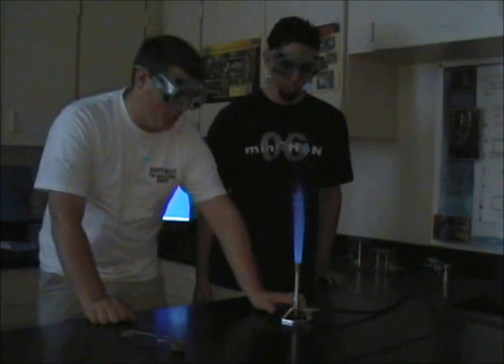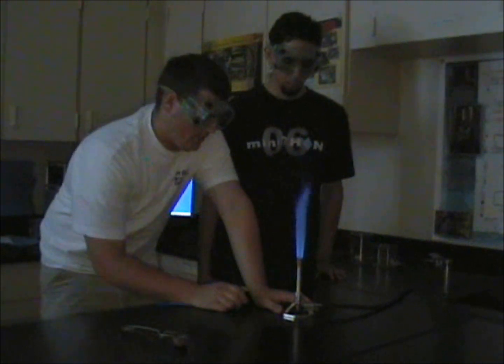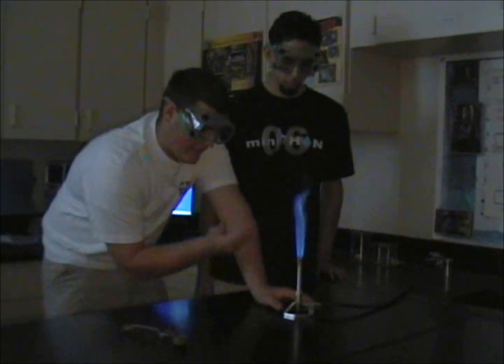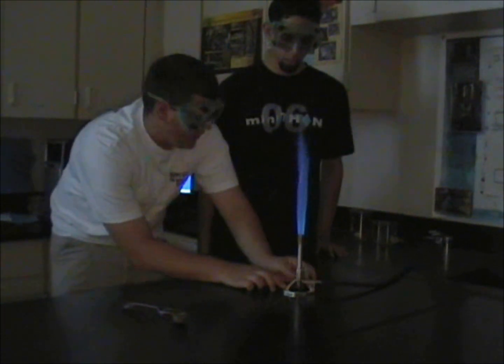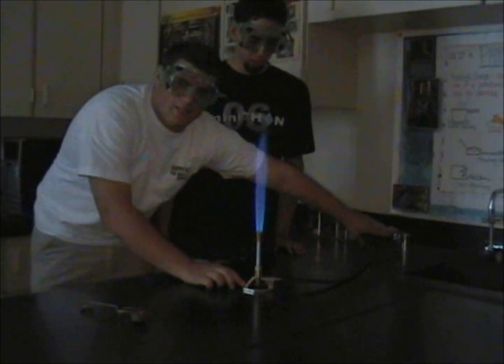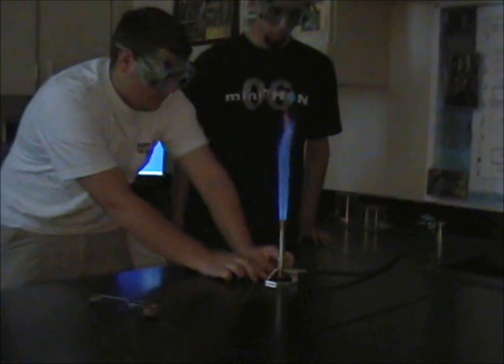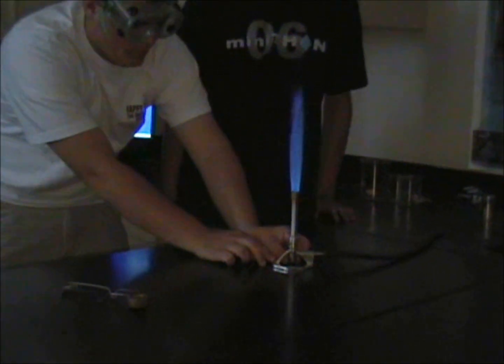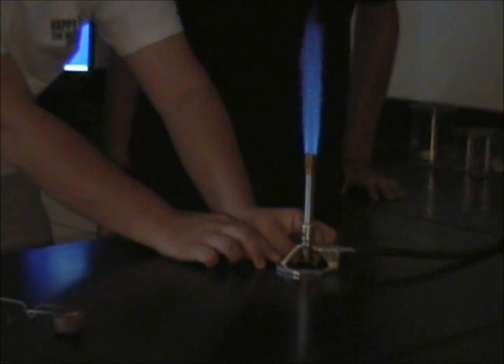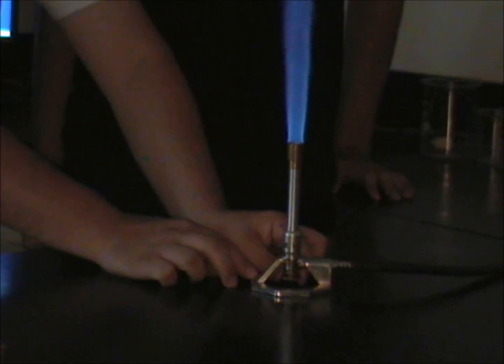Now we are going to talk about adjusting the different types of flame. When adjusting the size of the flame, we want to always remember to use the bottom gas valve, not the valve back here where the gas comes out of the system — we either need to be on or off. This is where we adjust. If we screw it in, our flame is going to get a lot smaller. If we screw it out, it gets a lot bigger.